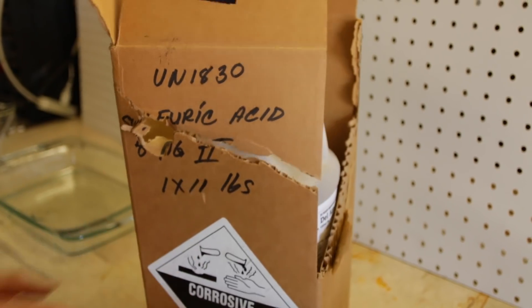In today's experiment we're going to mix sulfuric acid and hydrogen peroxide to create piranha solution. It's pretty gnarly.